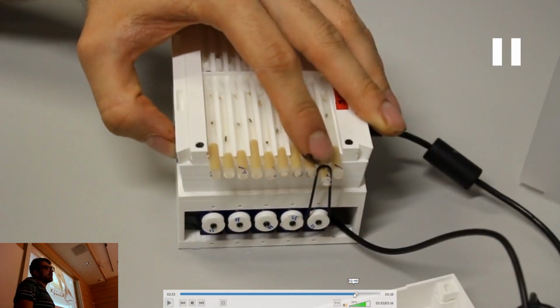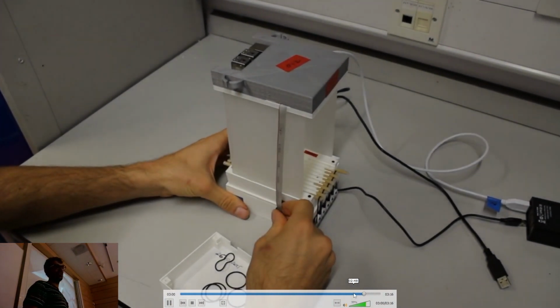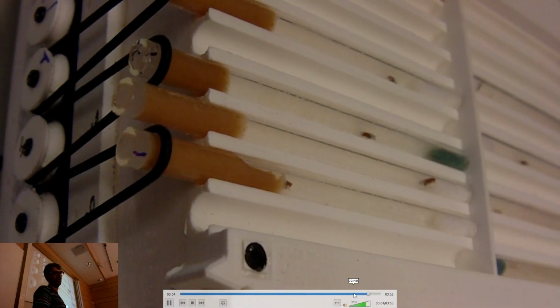And here is an example of why you would want a closed loop system. Not only were we able to track them in real time, but we were wondering what happens if you perturb their sleep a little bit. So we can monitor them, and whenever they doze, we actually give them a small stimulus. For that, we built a module underneath that is able to deliver the stimulus by just turning little motors that move these bells, as you can see here.